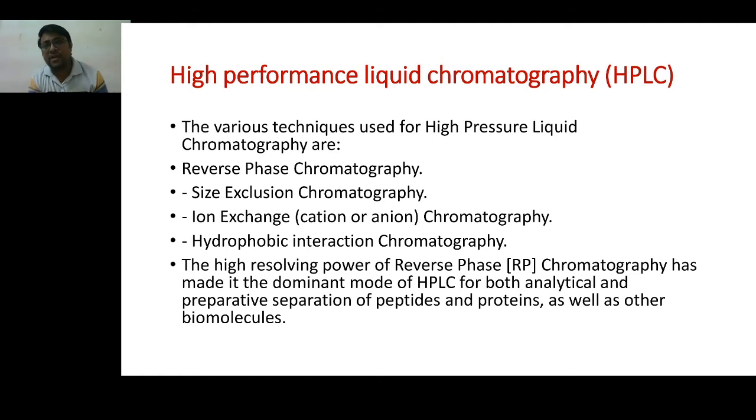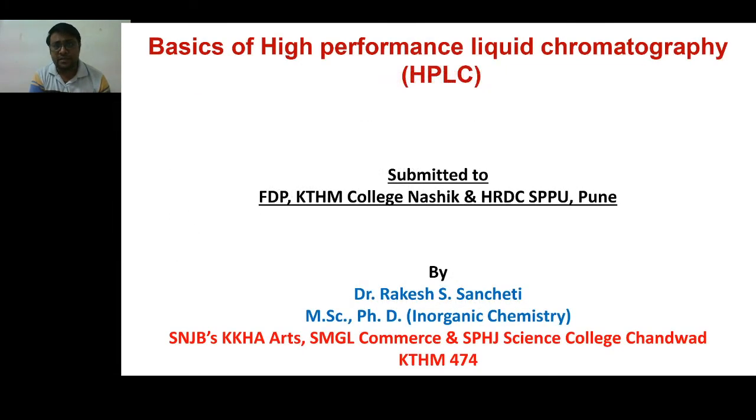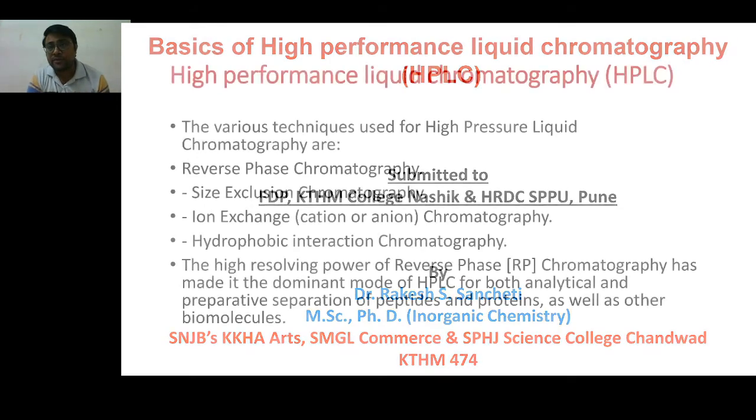Usually stationary phases are polar, and due to this polarity, the components bind on the surface. So this is the very basic principle of chromatography. But we are going to discuss here the HPLC, one technique among all the techniques of chromatography.